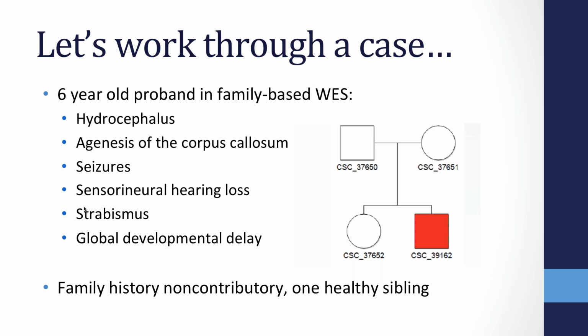And I thought the best way to do this, what I find most helpful, is to do it through the lens of an actual case. And so what we'll do is go through the process of next generation sequencing for a child we saw here in clinic, and the process of analysis and filtering the VCF variants into where we think we found the diagnosis for this child.